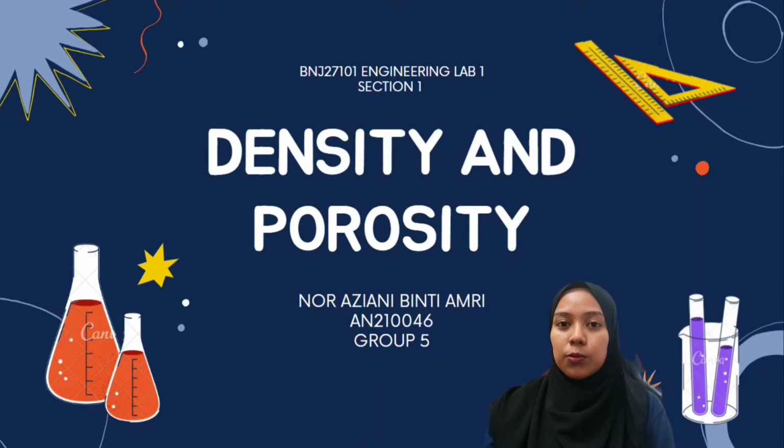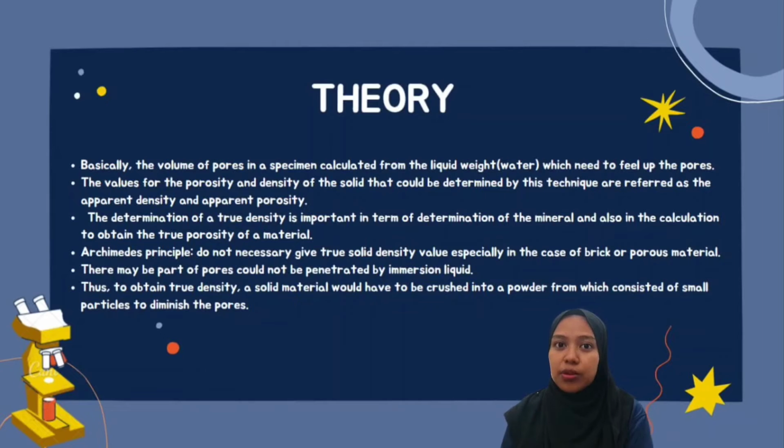So today I will make a presentation about the chosen topic for me, which is the density and porosity experiment. Basically, the volume of the pores in a specimen is calculated from the liquid weight, which is water, which needs to fill out the pores. The values for the porosity and density of the solid that can be determined by this technique are referred to as the apparent density and apparent porosity.